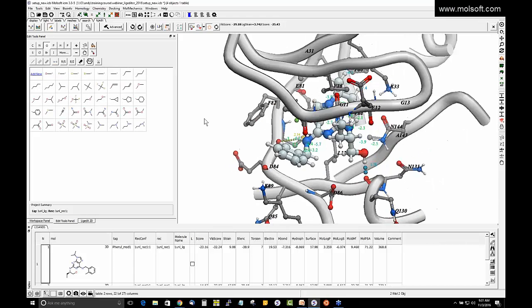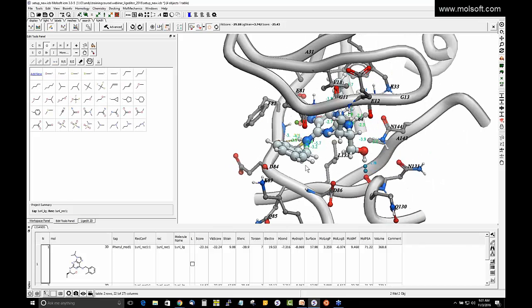So we tried interactively a few. We tried one halogen, and it seemed to improve. So we can actually try fluorine, chlorine, bromine, iodine, all in one go, along with some other groups that we can check. So there's sulfonyl, sulfonamide.